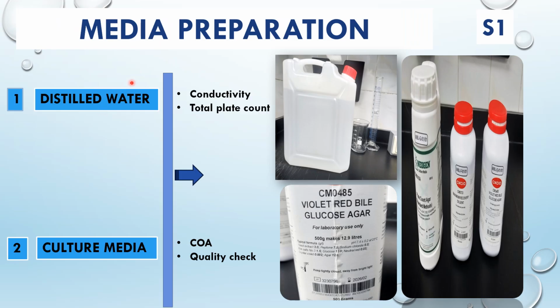From the first step, the most important thing here is that we use distilled water, and the International Organization for Standardization, ISO, recommends that we check the conductivity and total plate count for this distilled water that we are using for our media. This is a very important thing. We need to check its conductivity against what the standards say.